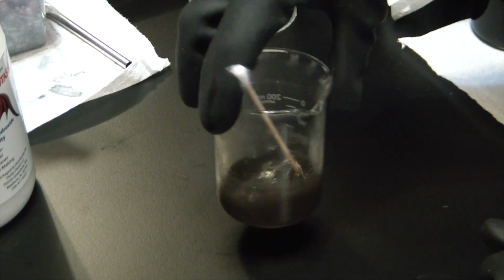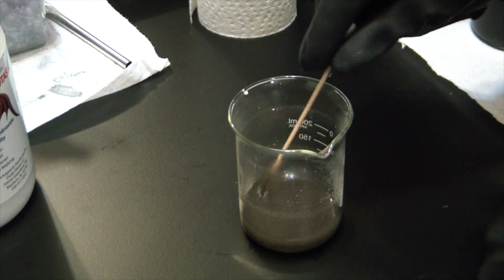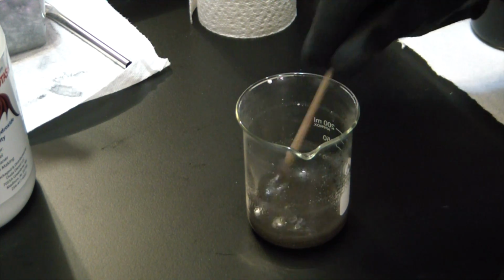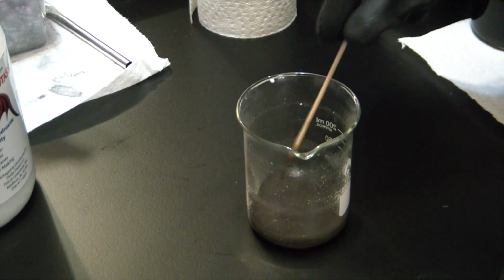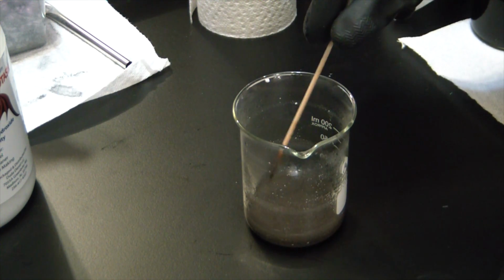Alright, we're left with a good bit of silver oxide, which we'll just throw in the crucible with a little bit of borax, and we should be left with a nice pure silver bead. Hopefully a bit bigger than a bead.